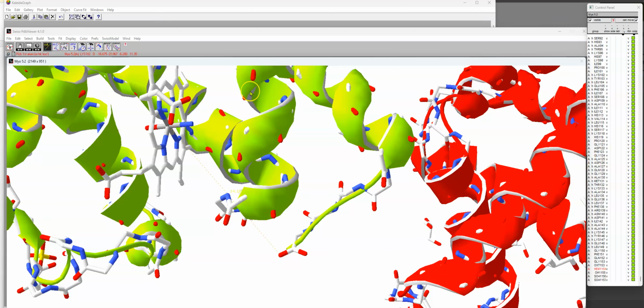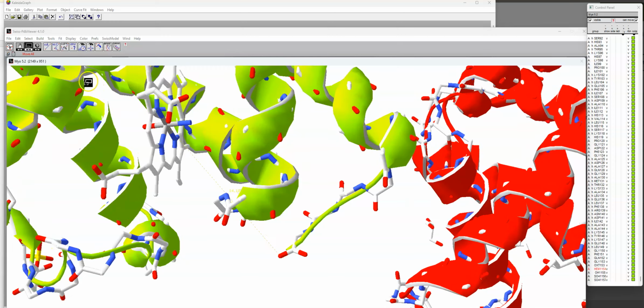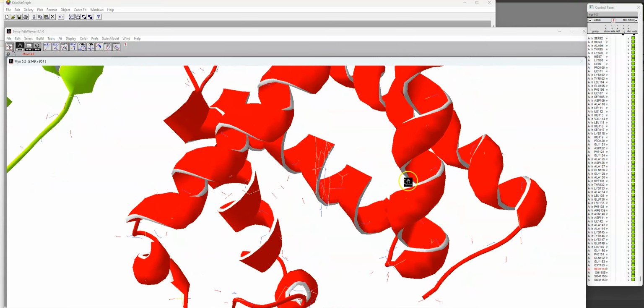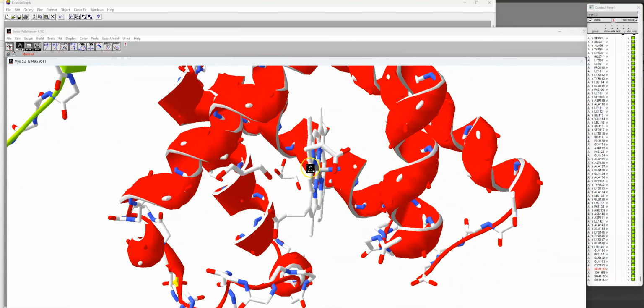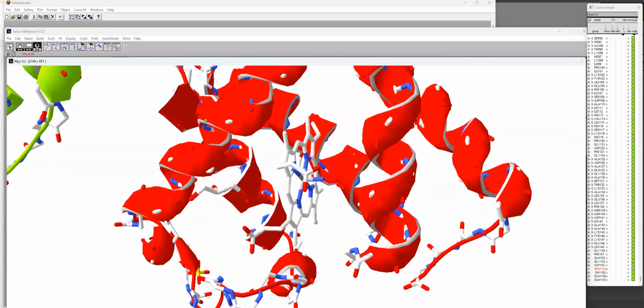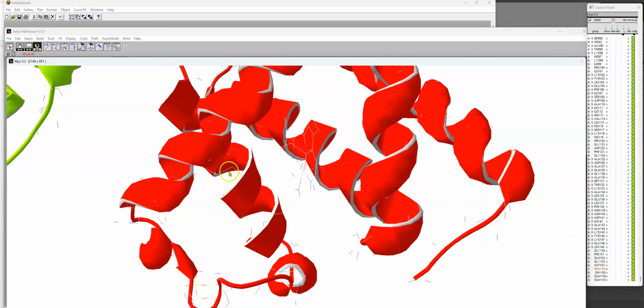And now I want to do the exact same thing over here with this. Whoops, that's not the one I want. I want this one here, so I'll just slide it over. This one, so I see the two spots again. If I try to click on that iron, I might accidentally click on something a little behind it. So I'm going to bend it out into open space if I can. I go to the picking mode here. Whoops, I covered up the iron. Gotta try again. Let's adjust a little bit.